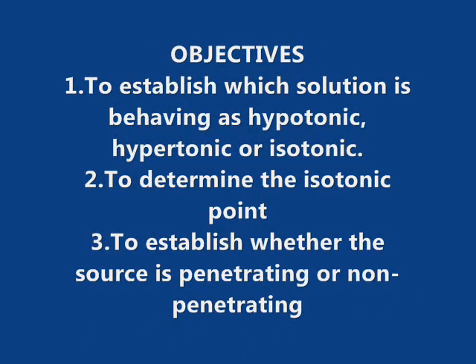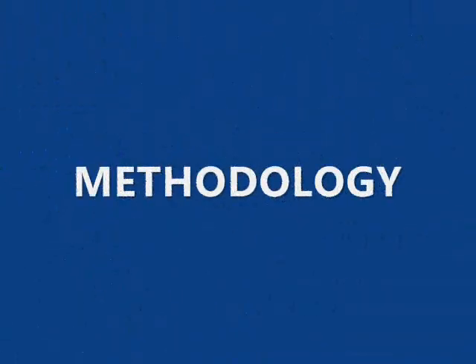The objectives are to establish which solution is behaving as hypotonic, hypertonic, or isotonic, to determine the isotonic point, and to establish whether the solute is penetrating or non-penetrating. This experiment will be performed in groups of 4 or 5.